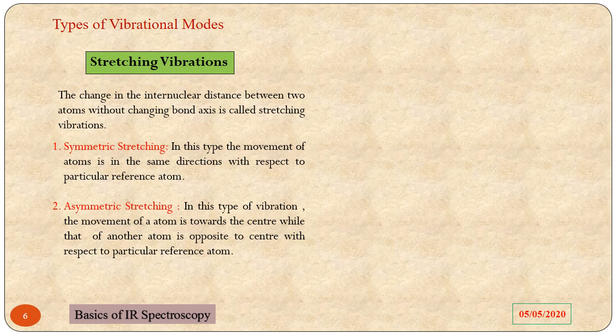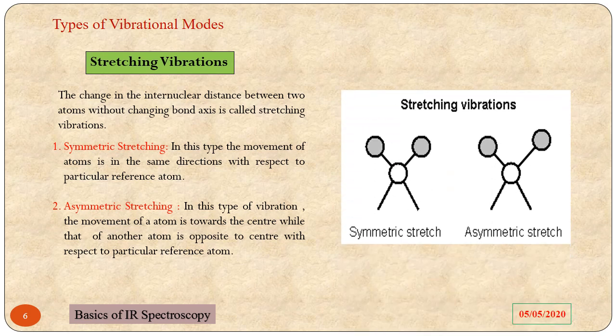We can see the stretching vibrations in the adjacent diagram, how the stretching vibrations work. These are two types: symmetric stretching and asymmetric stretching. Now we will see the bending vibrations.